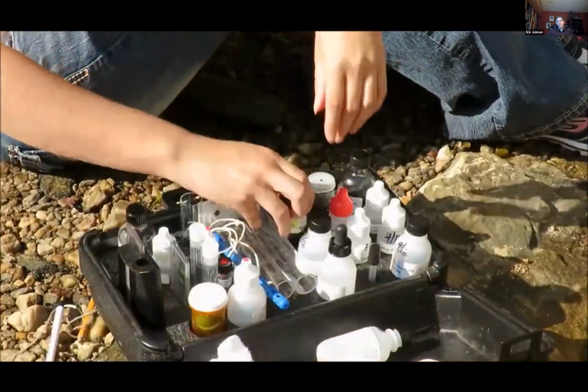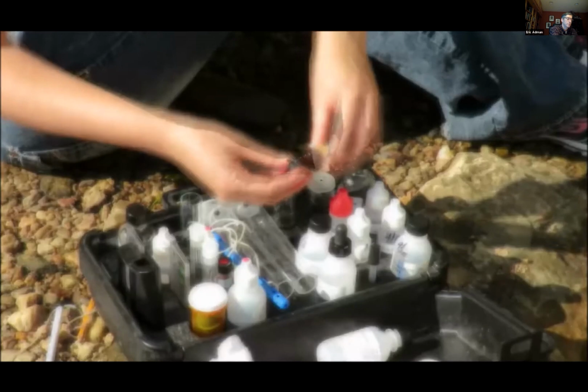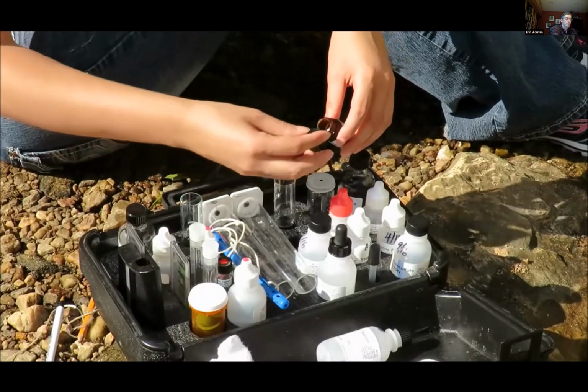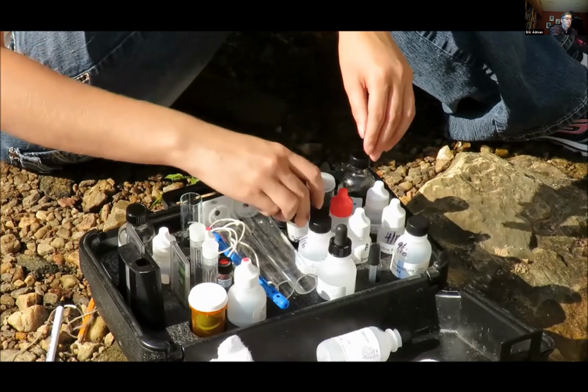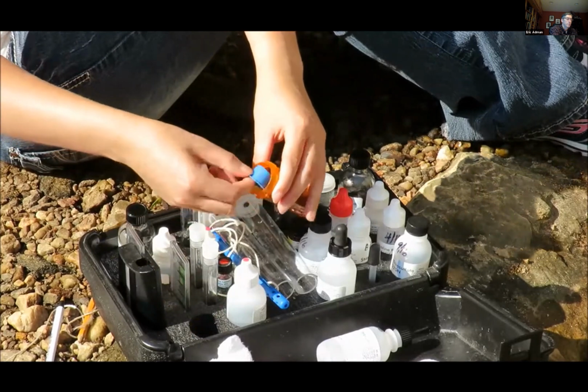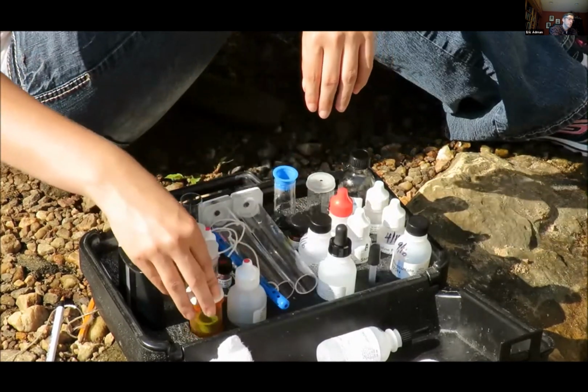Locate the BCG MR tablet bottle. This reagent is in tablet form and is very soluble. Take extra care to not touch the tablet or allow any water to enter the tablet bottle. Use the cap of the tablet bottle and dispense a single tablet into the water sample. Cap and shake the tube until the tablet dissolves.